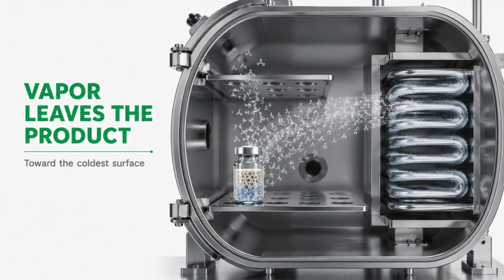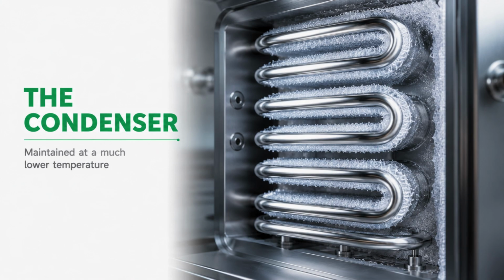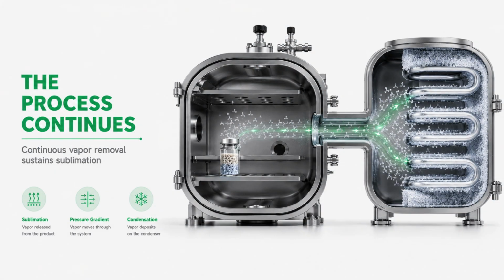Once vapor leaves the product, it travels through the chamber toward the condenser, the coldest part of the freeze dryer. Here, the vapor freezes again and deposits as ice. By continuously removing water vapor from the chamber, the condenser maintains the driving force needed for sublimation to continue.